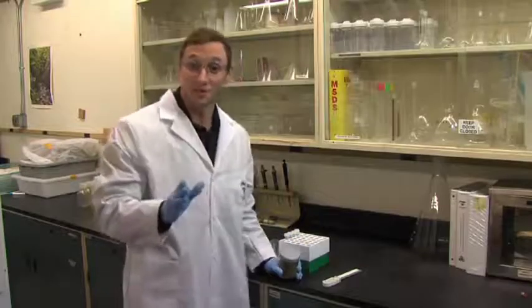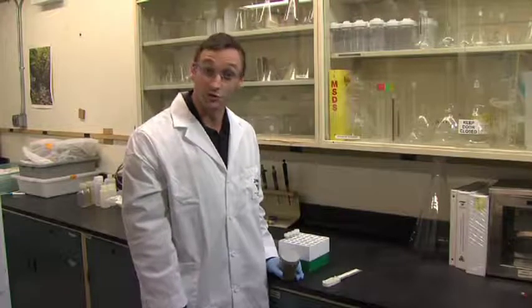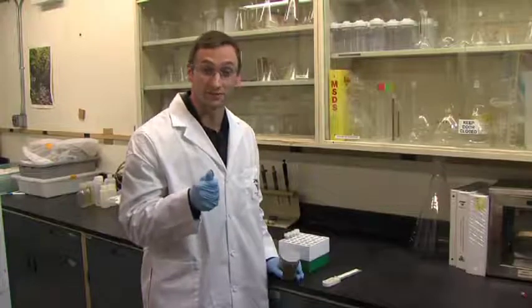This is another reason why the soil handling procedure needs to be well thought out by the project manager to ensure that the laboratory analysis data will be useful for making the project-specific decisions. During transportation, samples may jostle around. The soil in the jar could be stratified as a result of the jostling. Larger particles tend to wind up at the top of the jar, while smaller particles end up at the bottom.